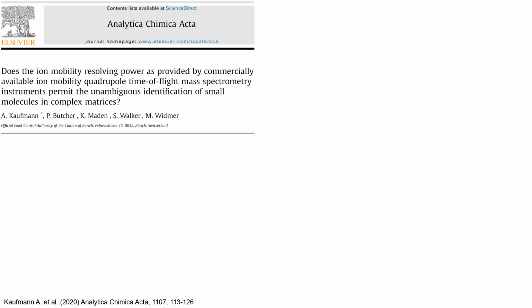Another issue of currently available ion mobility mass spectrometry instruments is the low IMS resolving power. I will try to explain this, and to do so I will use a very recent paper from Kaufman where they presented the case study of veterinary drug residues to find out if the use of CCS thresholds brings any additional benefits in regulatory methods for high throughput screening of contaminants and more generally small molecules in complex matrices.